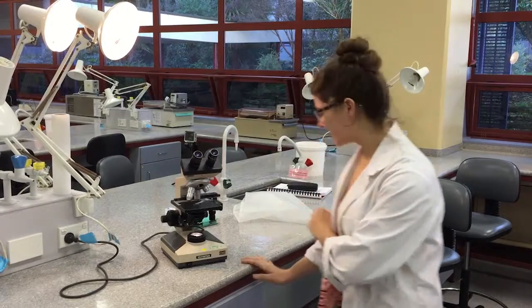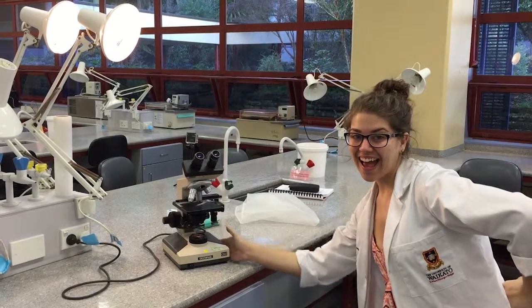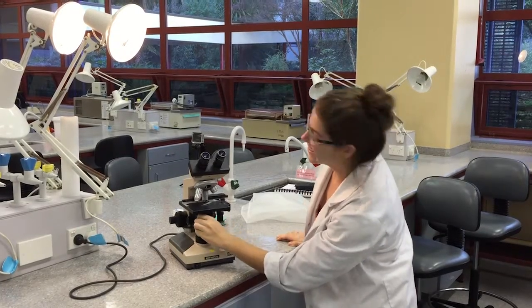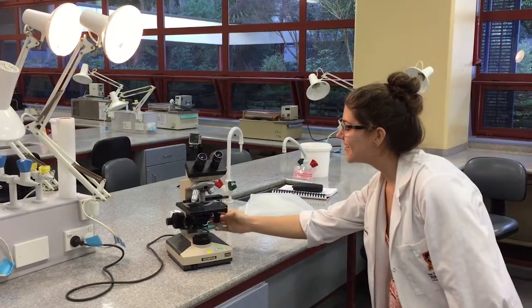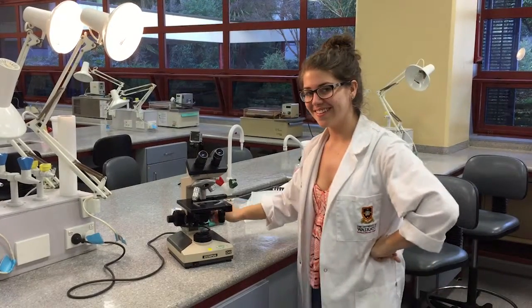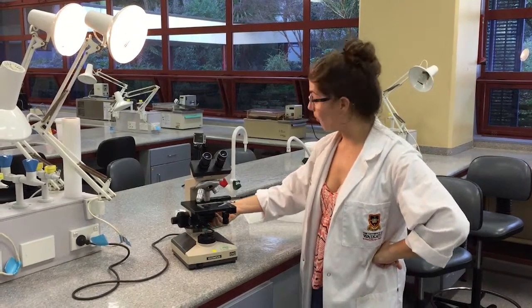The revolving nosepiece holds several objectives. It must be turned by the disc, not the objectives. Each objective has a different magnifying power — we have 4x, 10x, and 40x. The viewer looks through the oculars to view light from the illuminator in order to examine a specimen.